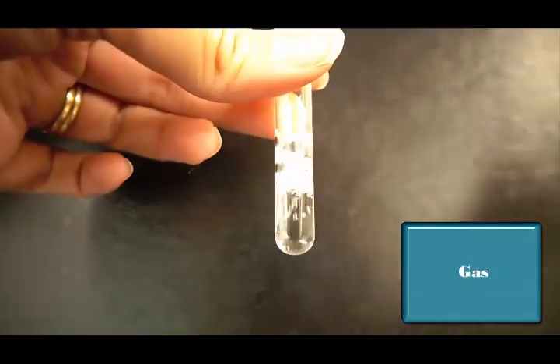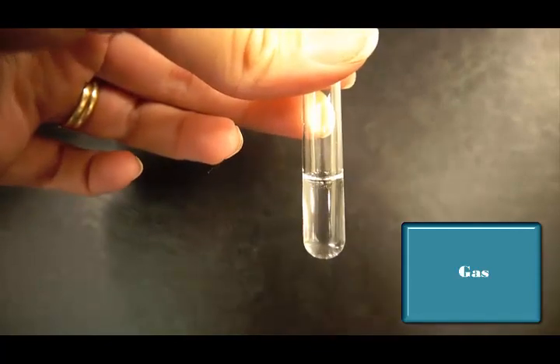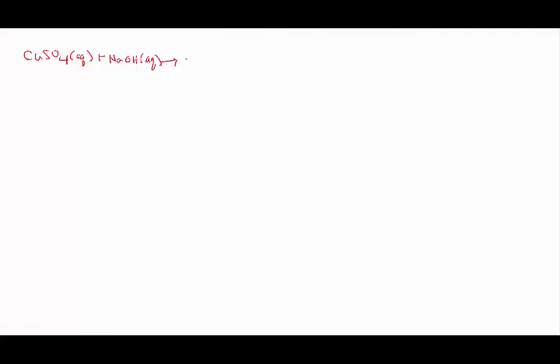For each test tube, you will need to write a molecular equation, an ionic equation, and a net ionic equation. First, predict your products by exchanging the cations. Be sure your molecules are neutral. Use solubility rules to predict the phases. Be sure to balance your equation. This is your molecular equation.